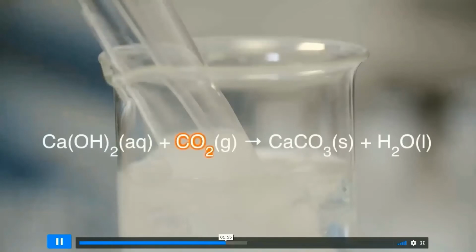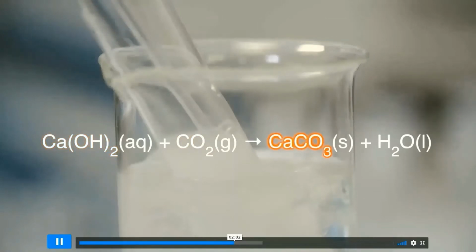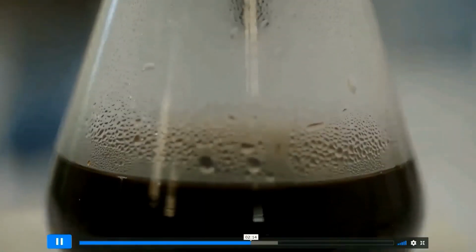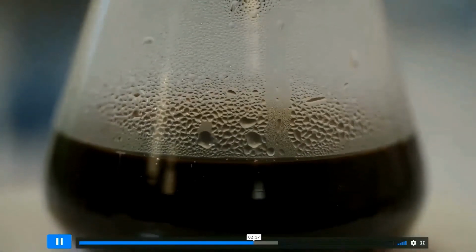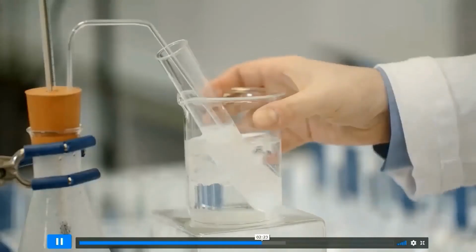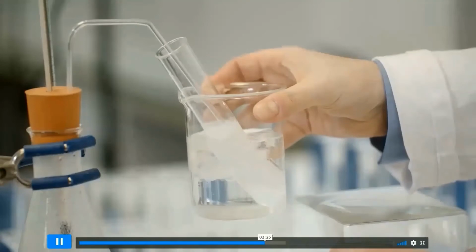The carbon dioxide reacts with the lime water, calcium hydroxide, to produce calcium carbonate as a solid, which is why the solution becomes cloudy. Using lime water is a good way to test for carbon dioxide. The solution should be heated for a further 3 minutes at the same temperature. Now the water baths are quickly swapped.